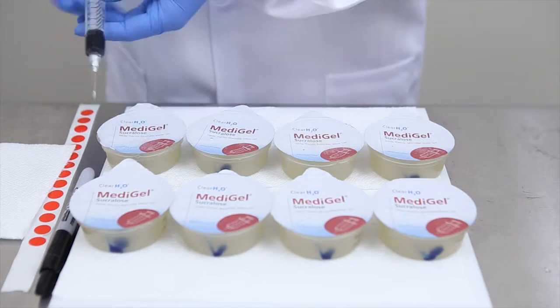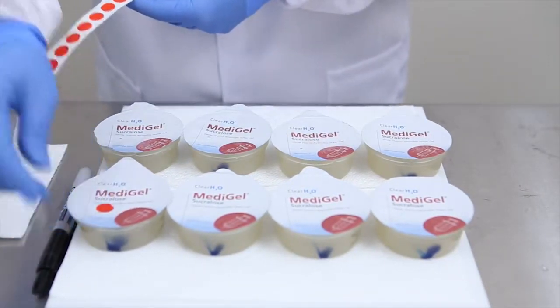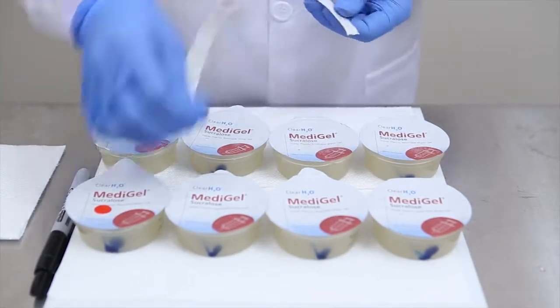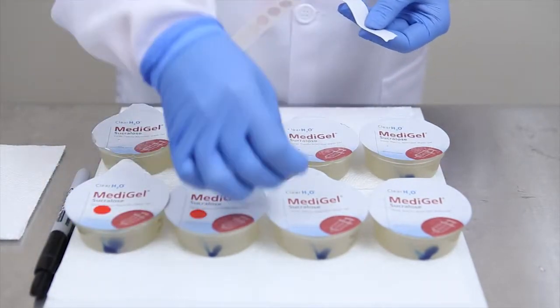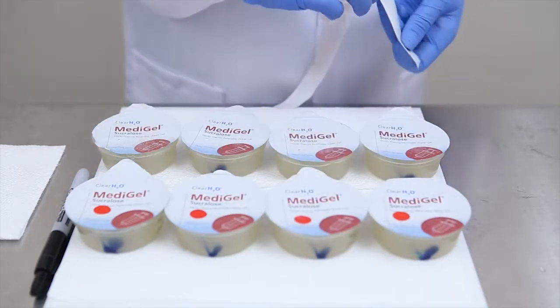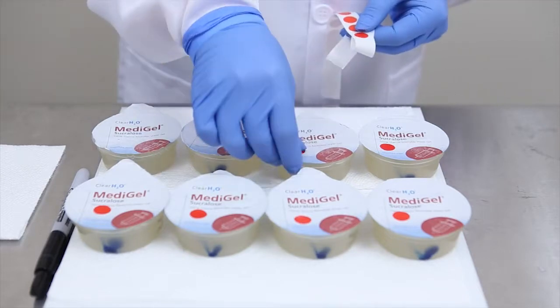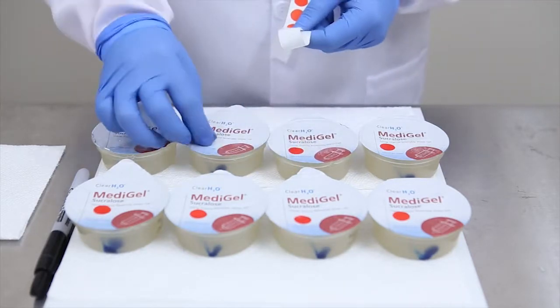For this demonstration, blue food coloring has been added to the medication as a visual aid to show thorough homogeneous mixing. Once the addition of medication is complete for all cups, place a sticker over each injection site and ensure good adhesion.